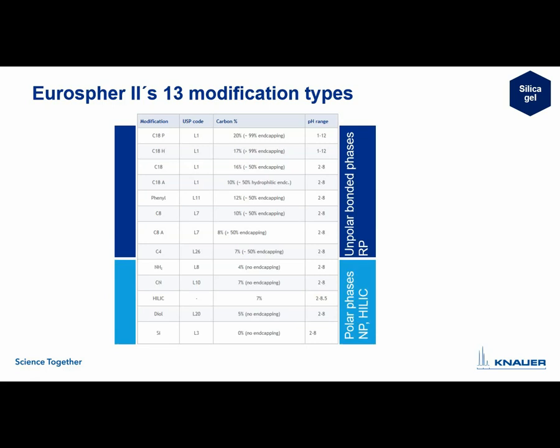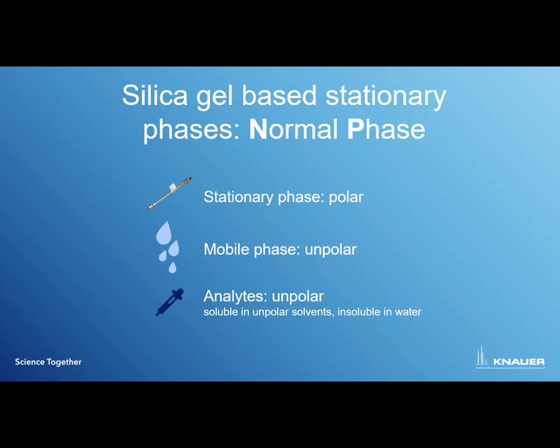And you already see here why this is a combination of two modes in one tutorial. This is caused by the stationary phases, because they are the same. And why can you use them now in different modes? This is what we want to talk about now. So first of all, we want to talk about normal phase.